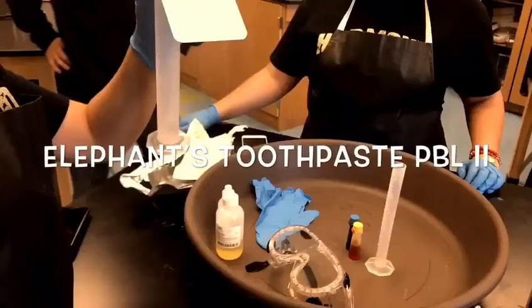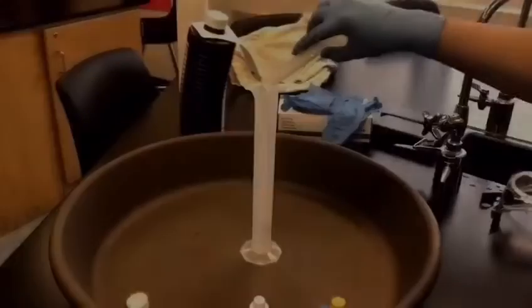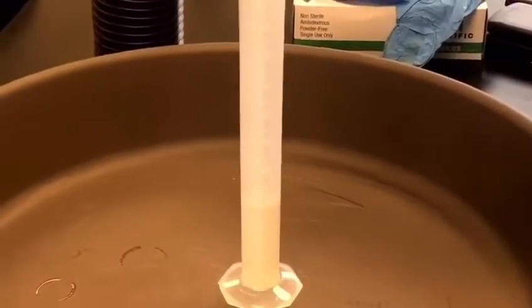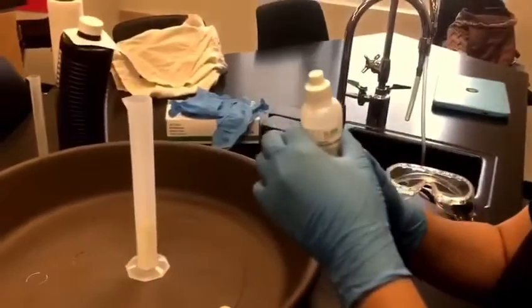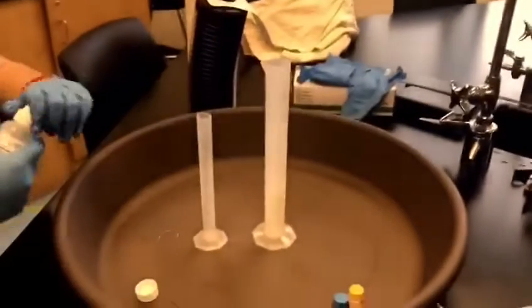Hi, we are students from Harmony Science Academy and we did the elephant toothpaste experiment for our PBL. The elephant toothpaste experiment is an experiment that forms bubbles from the decomposition of hydrogen peroxide, where the products from the decomposition mix with the dish soap. The potassium iodide acts as a catalyst to this experiment. A catalyst is a chemical that increases the speed of the chemical reaction that is occurring.